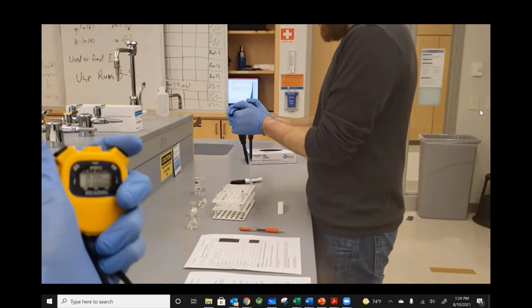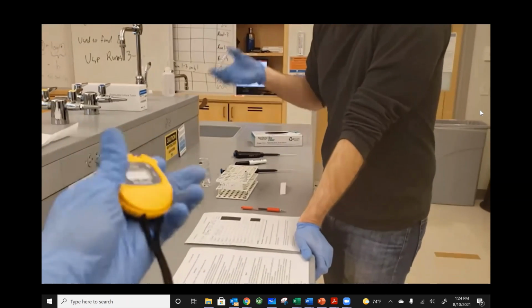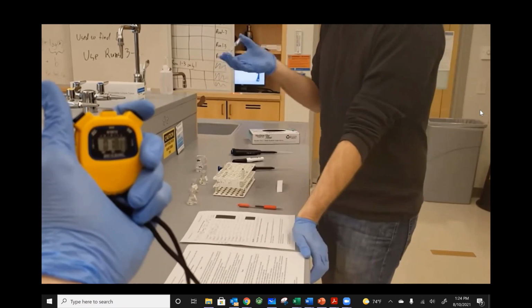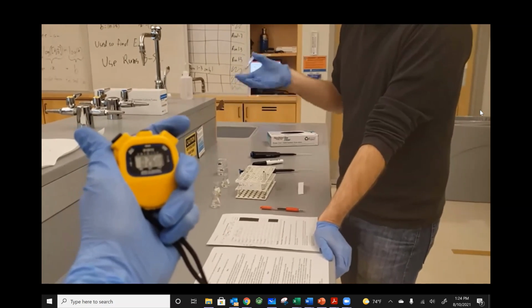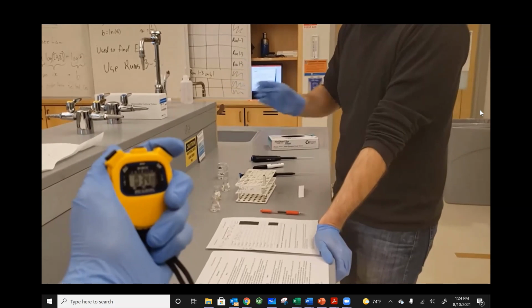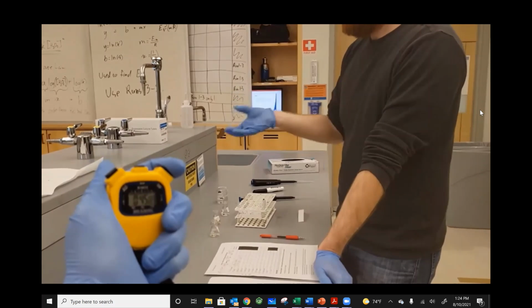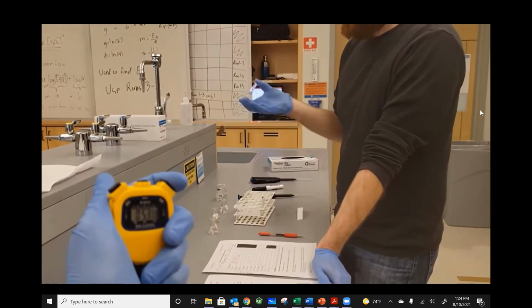And go. This should be even faster than run 2 because it has even more hydrogen peroxide present. The last one was a minute faster, so this one could be a minute faster.